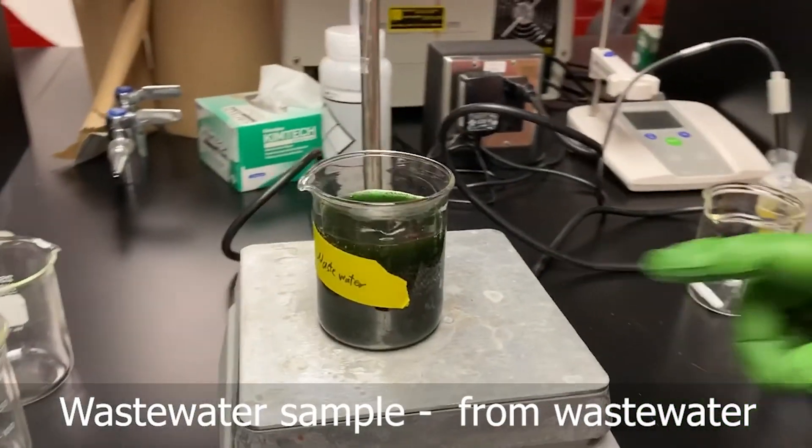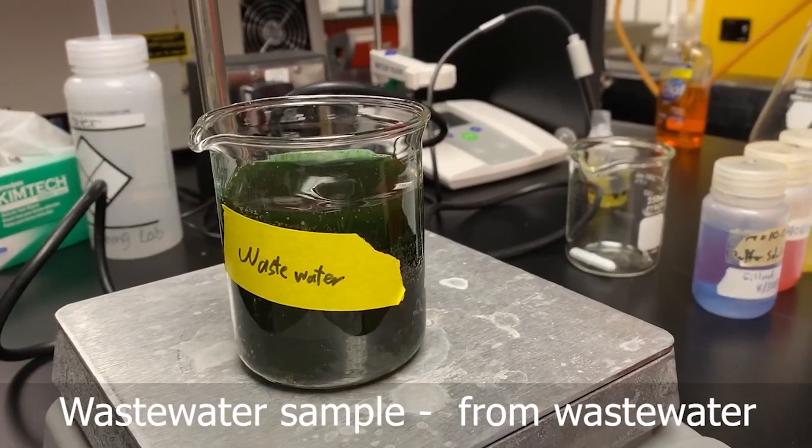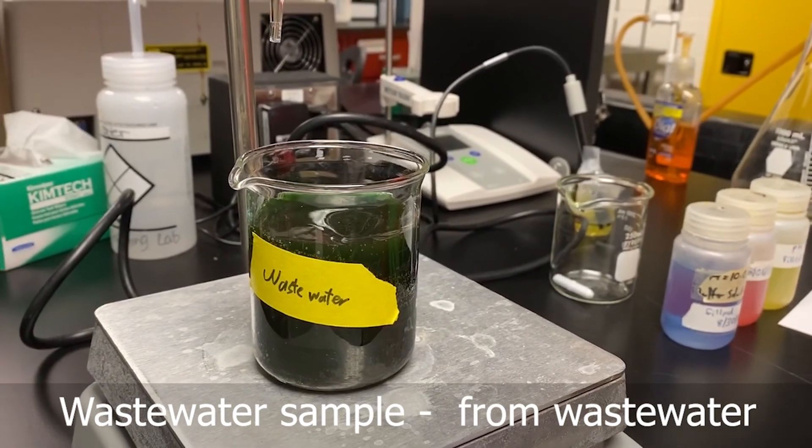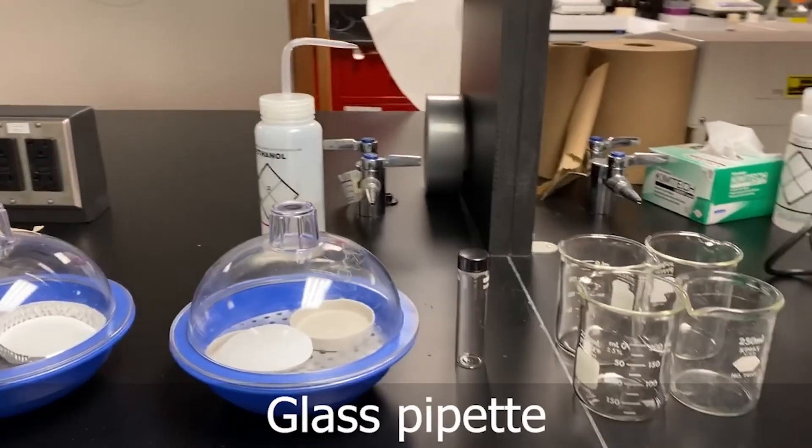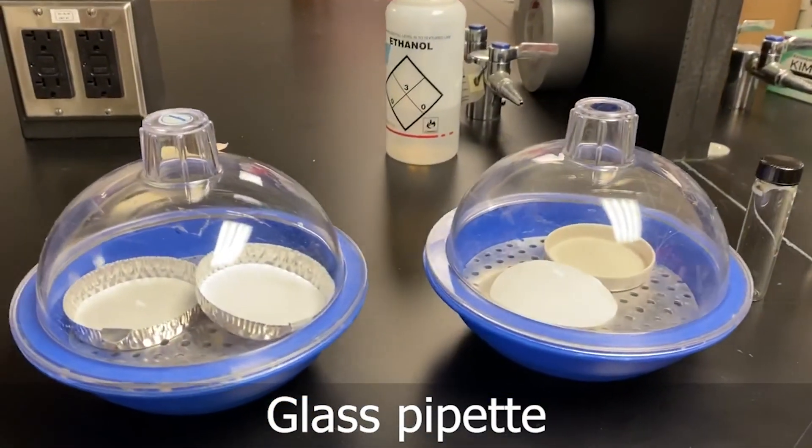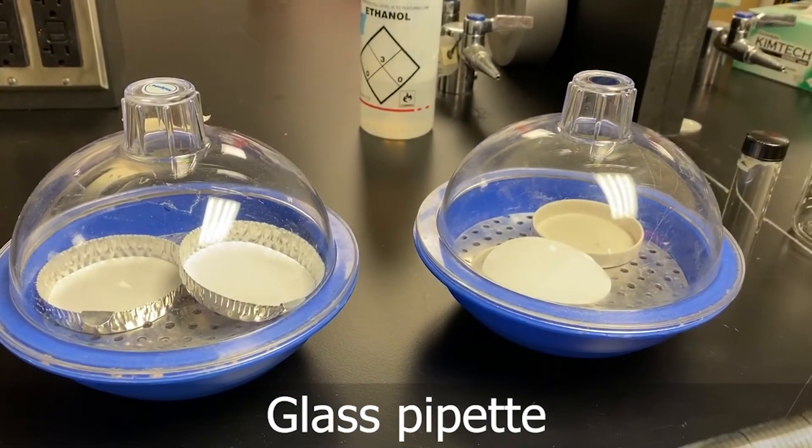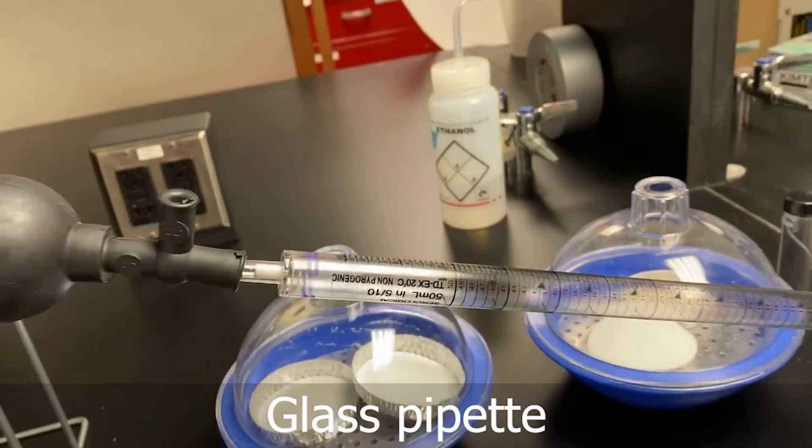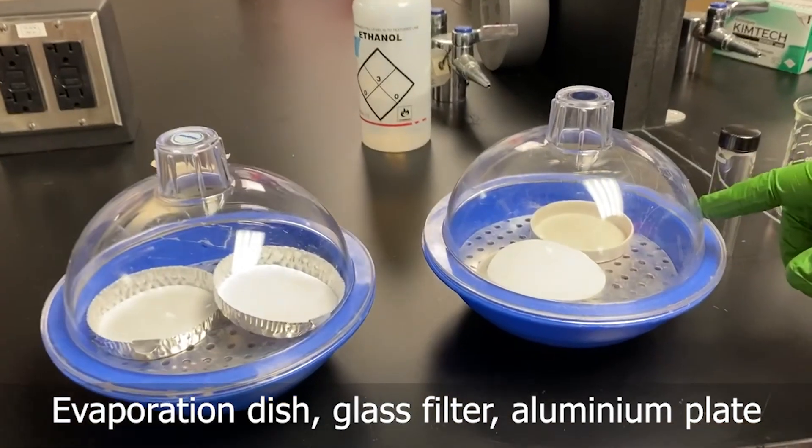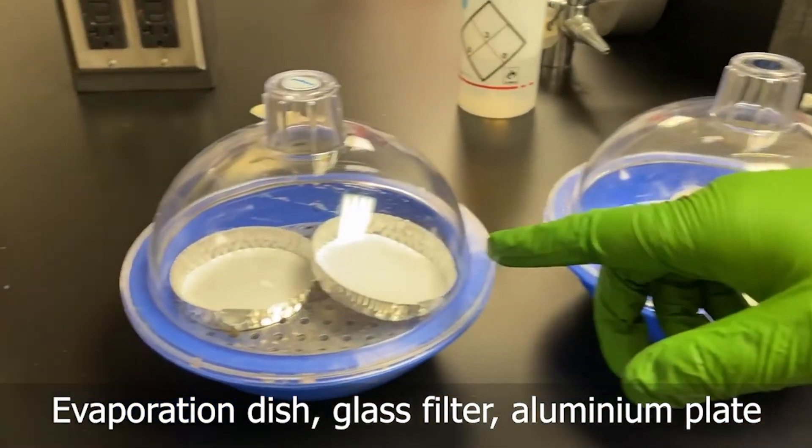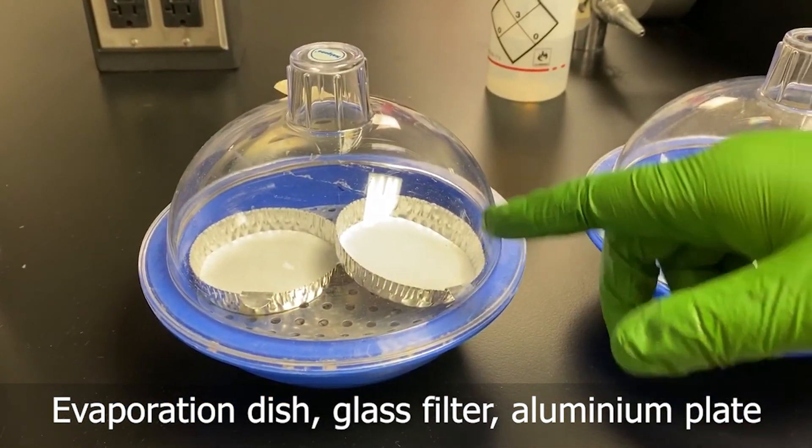So this is a sample, and this sample is the wastewater taken from the wastewater treatment plant. For this experiment, we need a glass pipette to grab the wastewater sample like this one, and we also need an evaporation dish, a filter, and aluminum plates like here.